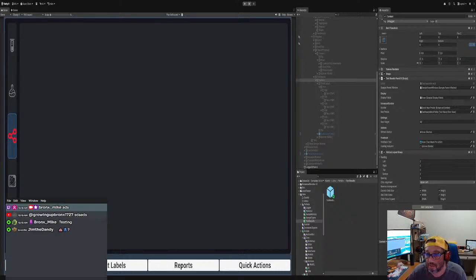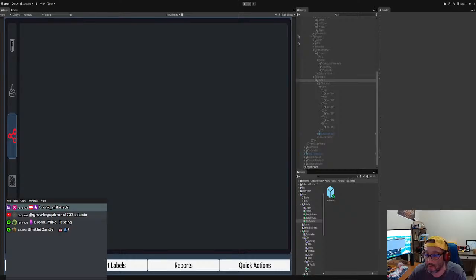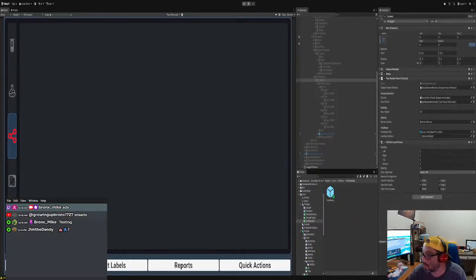Okay, so boom boom boom, fix query, fix scroller hierarchy, show results by ID if you want to, load the data. We got a green squiggly line. I'll explain that later. You're supposed to do it in a wait, but since sometimes we do references, events, you can't really use that. It's hard to do it.